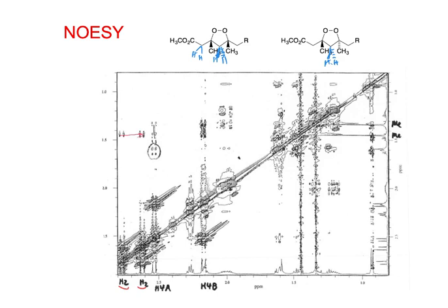What we can also see here is these two cross peaks are between H2 and the two methyl groups. And so what we see, which I guess is what we would expect, is that both of these are showing NOE just to the methyl group that's adjacent to them. Okay.